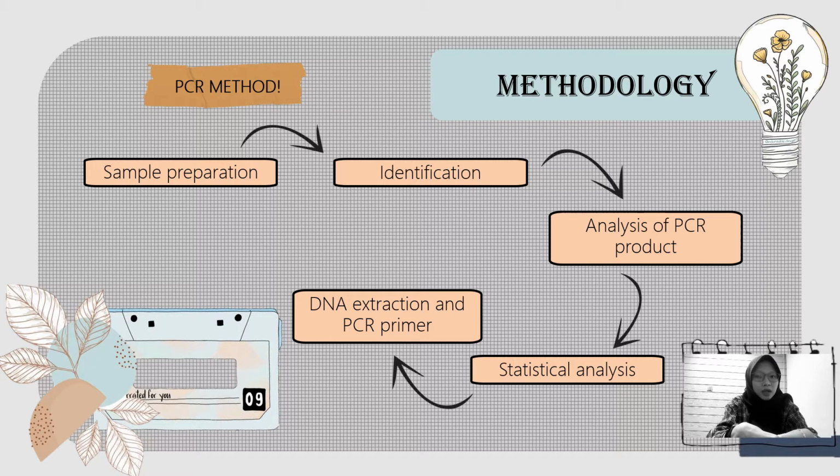Further, the primer pair 8 forward and 1391 reverse was used for the amplification of an approximately 1.5 kb fragment of the bacterial 16S rRNA gene. PCR was carried out in a 20 µL reaction volume containing 1 times PCR buffer, 2.5 mM MgCl2, 200 µM of each deoxynucleoside triphosphate, 500 nM of each primer, 2.5 U Taq polymerase and 2 µL DNA template.